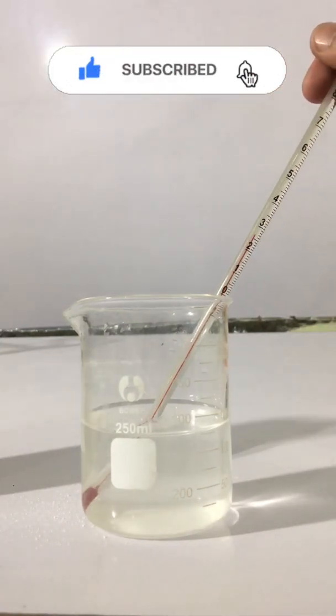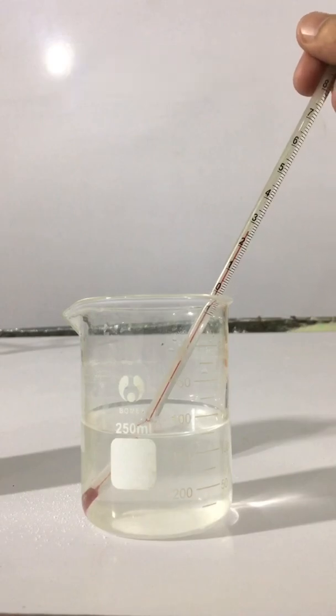You can see that the temperature goes down when I dissolve ammonium chloride in water, as the temperature decreases to 25 degrees centigrade.